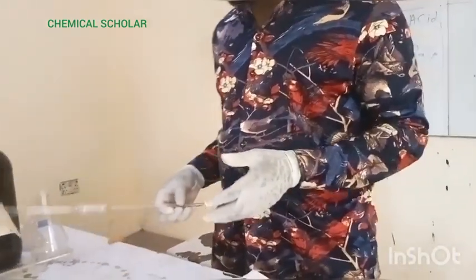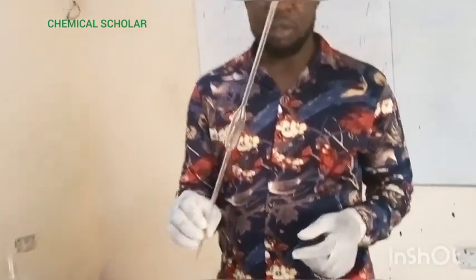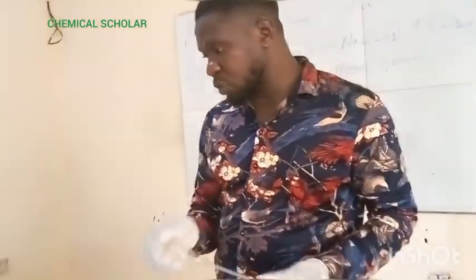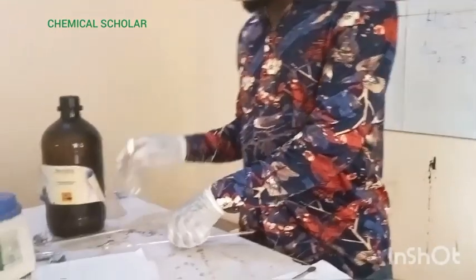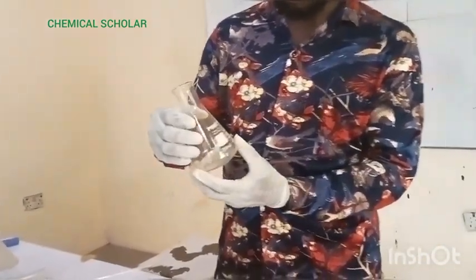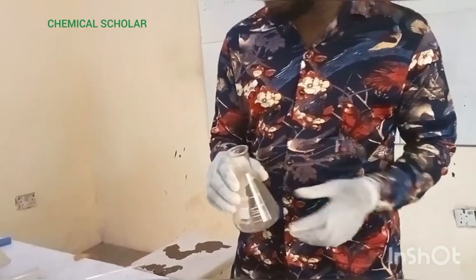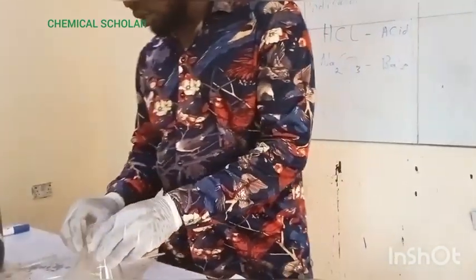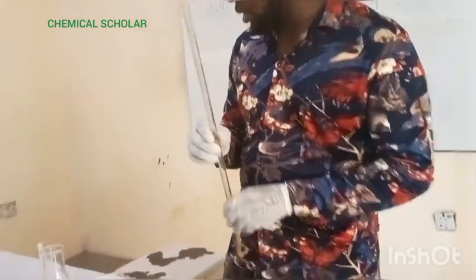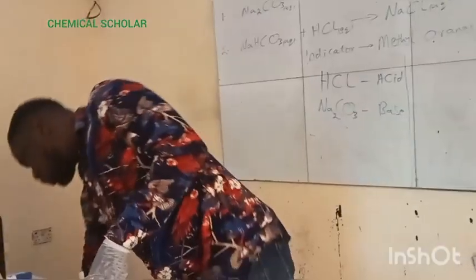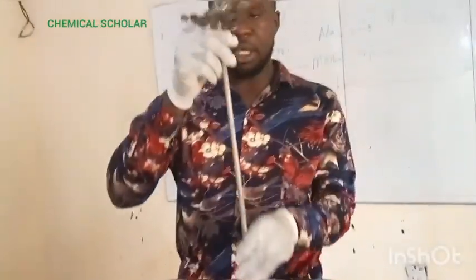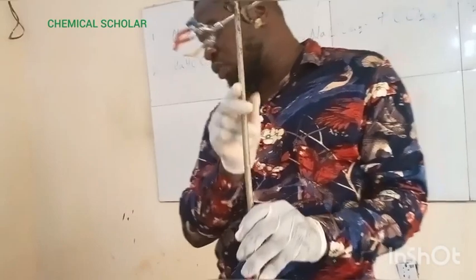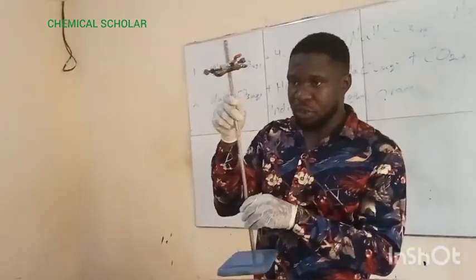There are other apparatus we are going to need, such as the pipette — this is a 25 cm³ pipette, that's what we are going to be using. Then you also need the beaker, and we also need this conical flask, and then we have the funnel here. These are some of the apparatus that we are going to use for this particular experiment.